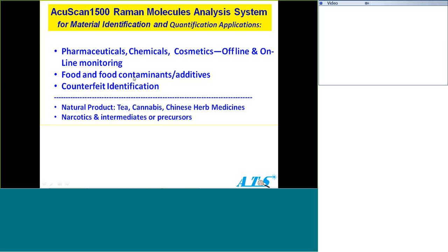And then you will enter the pixel number, the wave number there, and from the result you have, the computer will calculate the correlation coefficient for you, by the way. You enter those correlation coefficients, then it will be calibrated against whatever you had before, say 1 year ago or 2 years ago. So that is the way to calibrate and validate your instrumentation in terms of wave number produced. Is it the same as 1 year ago or as what it's supposed to be?